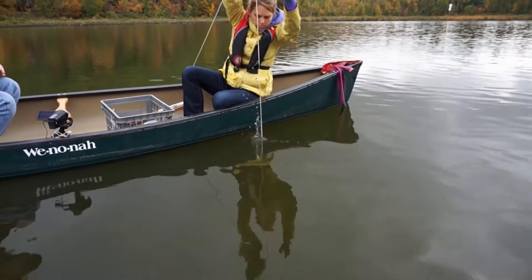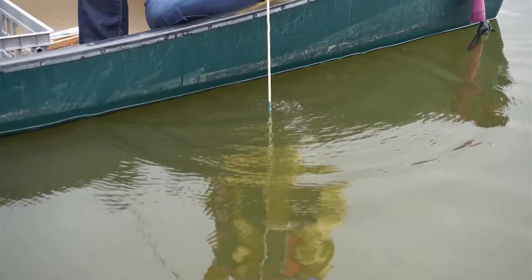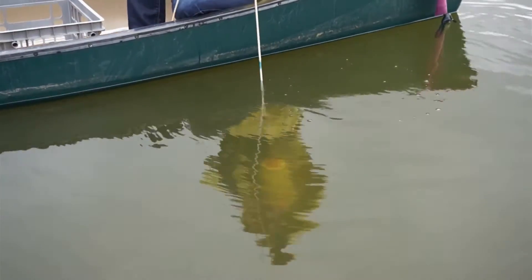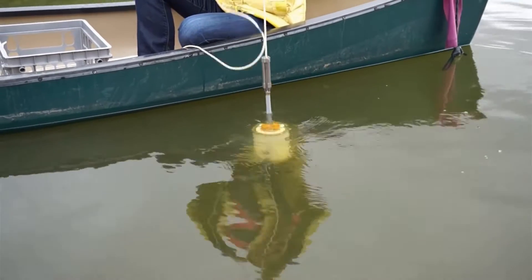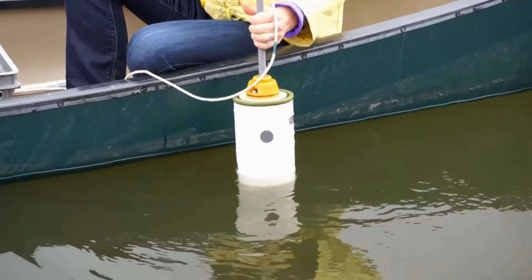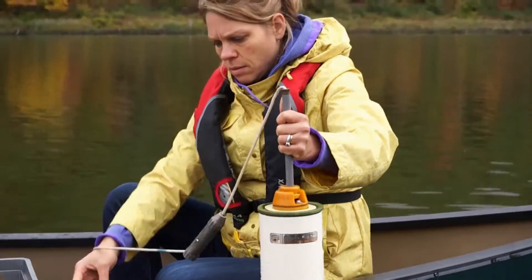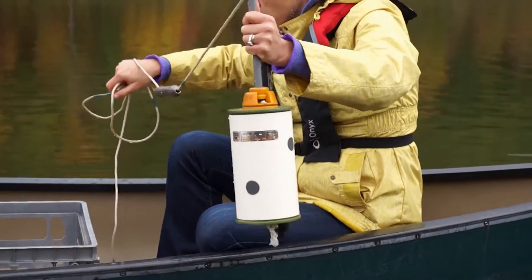Do I have to push it? No, you should just be able to gravity drop it. You may notice for some of the older Kemmerer bottles, you might need to give a little tug just as the messenger hits it to help trigger that. Then you're going to slowly bring it back up, holding the line, and then grab the gray shaft to prevent the water from spilling out of the Kemmerer bottle.